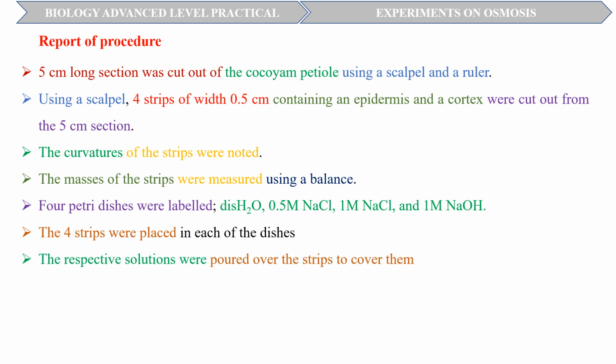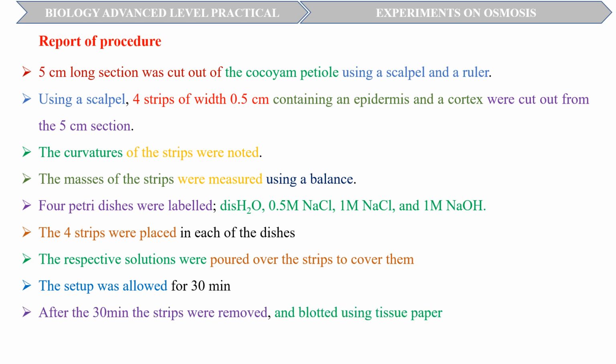The respective solutions were poured over the strips to cover them. The setup was allowed for 30 minutes. After the 30 minutes, the strips were removed and blotted using tissue paper. The curvatures and mass were again measured.